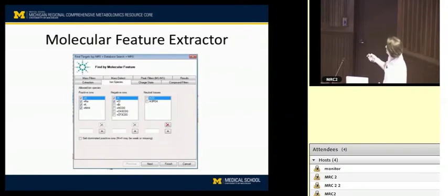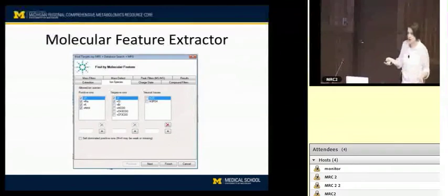There's pros and cons to letting the software pick a bunch of different adducts or ion choices. A pro is that the more signal I can gather together into one metabolite of interest, the more likely that signal is to average out to be a little more stable over all the samples of interest. In other words, if some percentage of my ions are picking up a sodium, would it be good to get the ones that are not sodiated and the ones that are sodiated together? Because, on average, my quantitation might be better.